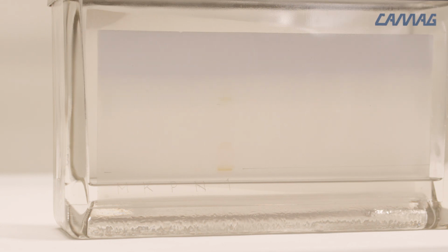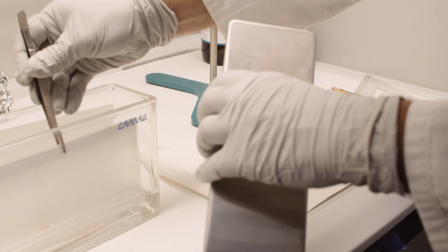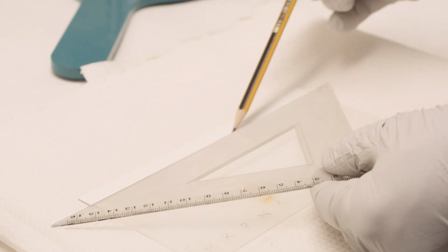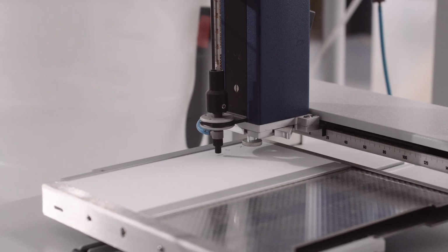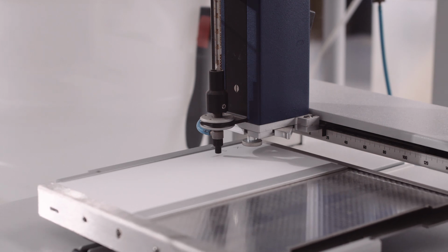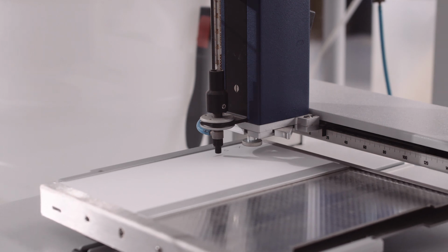When we observe that the solvent front reaches the mark for the front at the top of the plate, it is removed from the tank, the level of the front is marked, and the plate is dried. In the exercise we will use an automatic applicator, which gives better resolution and repeatability after developing.